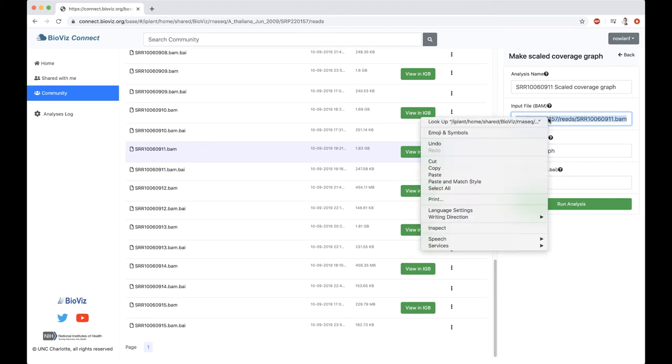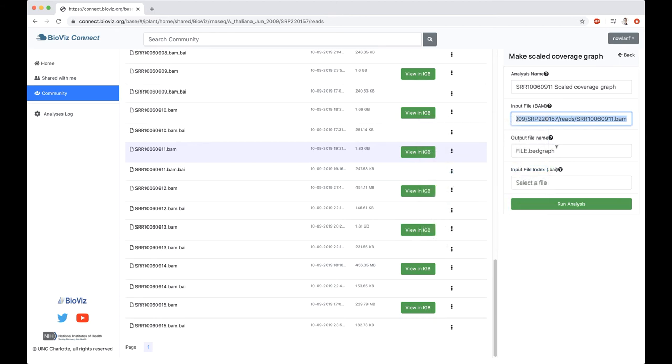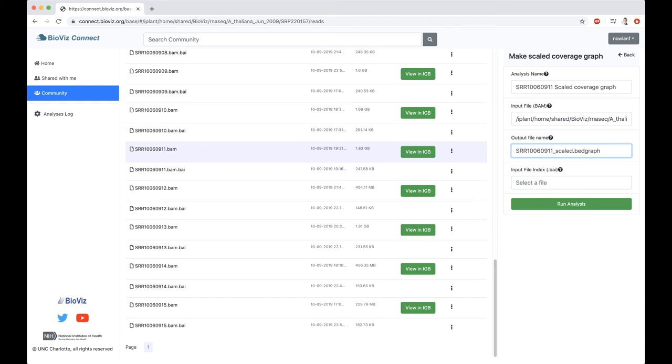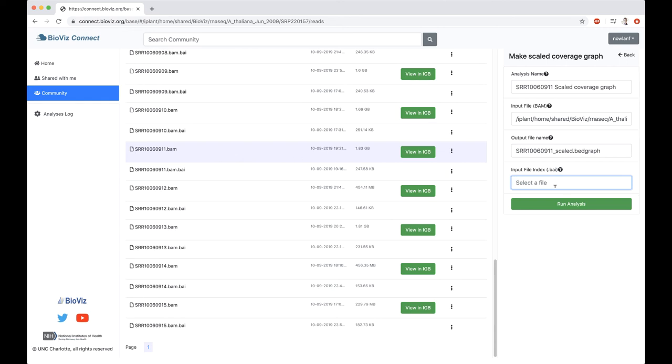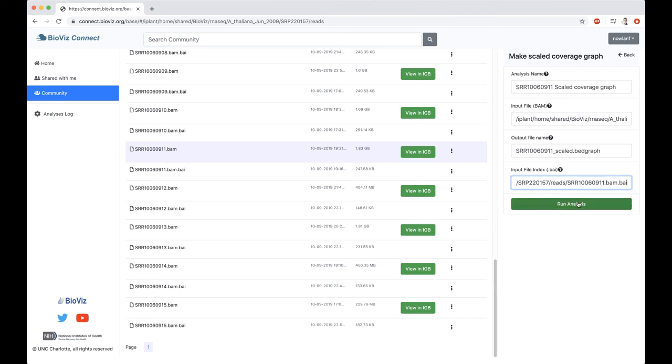I'm going to copy that. I'll need it here in a second. Output file name. I'm just going to give it SRR10060911. And I'm just going to add Scaled, just so I remember that this is the Scaled Coverage Graph that I've created. You'll see that the output here is a bedgraph file. The final piece we need is the BI file, or we need to tell the app where our BI file is, or the name of our BI file. In this case, it is the same name, just .bam.bai. And I do need the full path to it. I copied and pasted what was here down here. And then I just have to add a .bai to the end of that. It's about the most complicated thing you'll have to do to run this analysis. At that point, I can just go ahead and click Run Analysis.